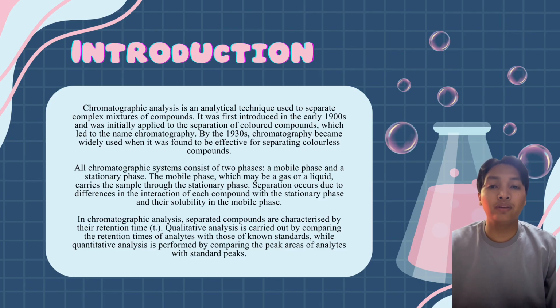In chromatography analysis, separated compounds are identified by their retention time. Qualitative analysis is done by comparing the retention time of an unknown sample with a known standard, while quantitative analysis is performed by comparing the peak area with the standard peak.